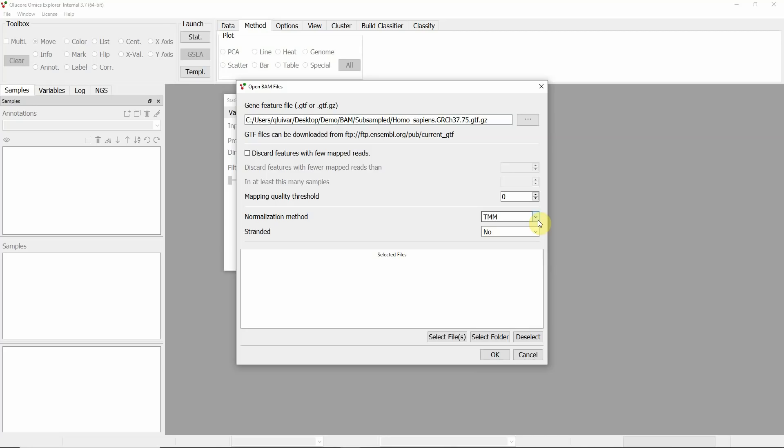TMM normalization also includes a mathematical transformation that enables the use of statistical tests such as the T-test and ANOVA. In this case, the data is not stranded.